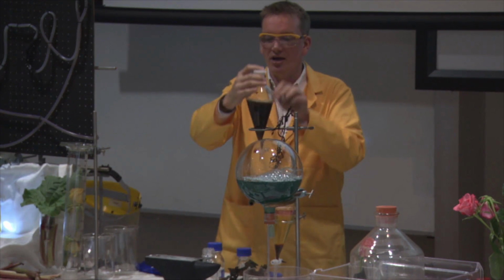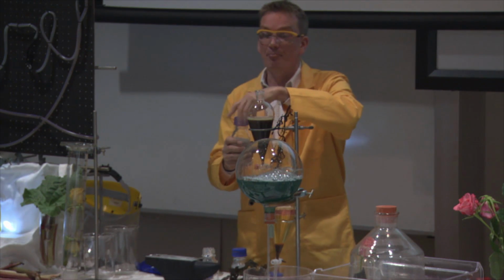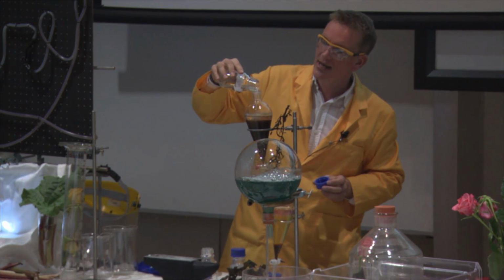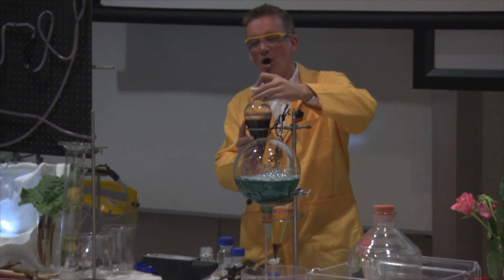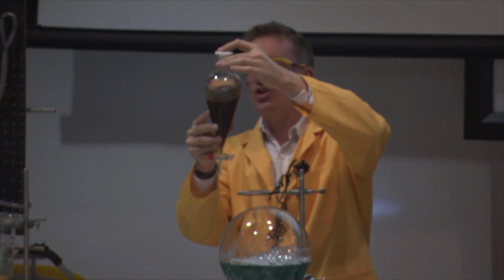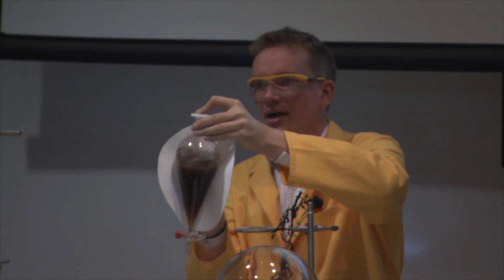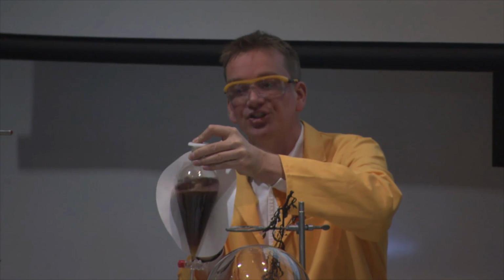Now unfortunately we can't see any iodine yet, so I'm going to add some hexane. This is basically from petrol, so I'm going to add this. And the iodine, if there is any here, it should dissolve, it should move from the water layer, the lower layer, into the top layer of hexane. And I'm hoping, I think we can just about see this, that the top layer is becoming pink. Okay, so perhaps if we put a piece of filter paper behind, I'm hoping that you can see that there's a slight pink colour there. And that's due to iodine that we've just made and extracted from our seaweed.